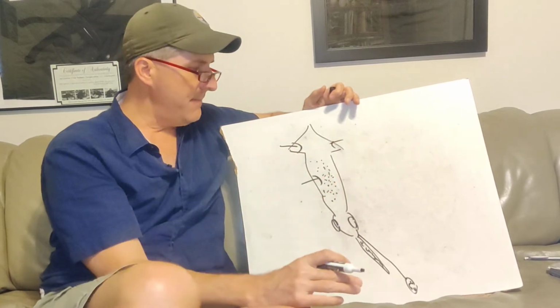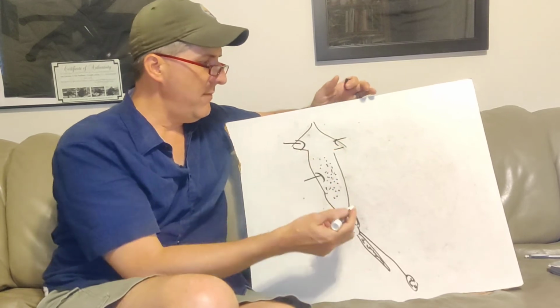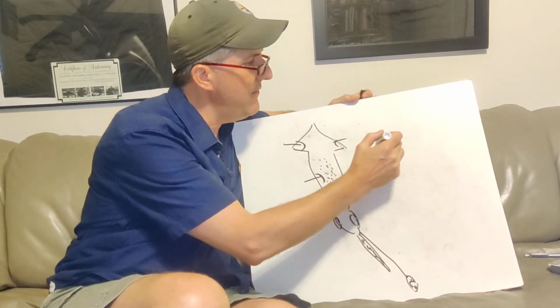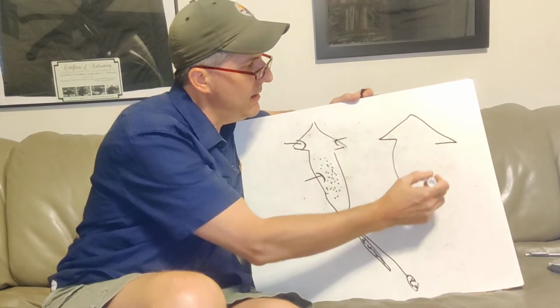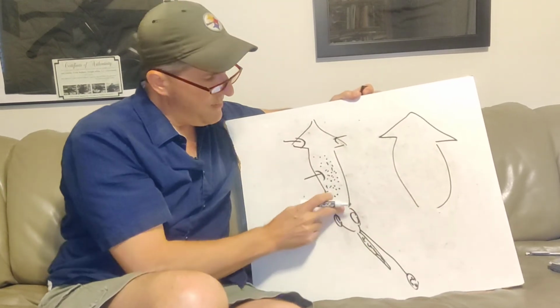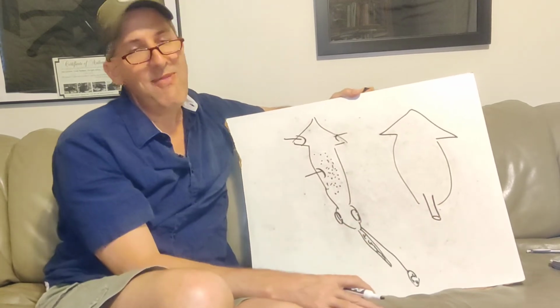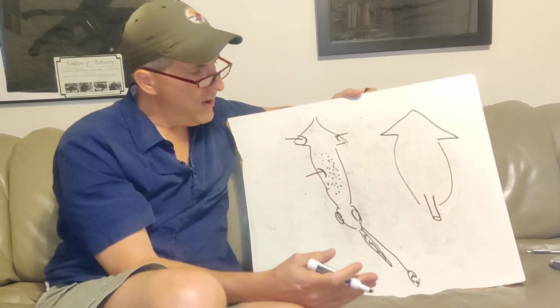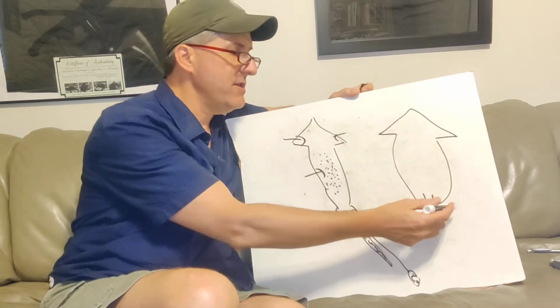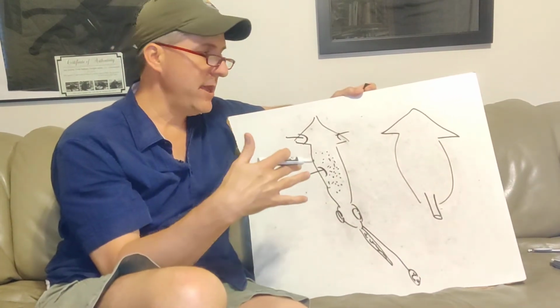Okay? Now, to do the dissection, what you would do is you would take this and flip it over. So I'm just going to have the same rough outline. First thing I tell you is when you flip it over, right where the mantle and the head meet, there's going to be this big muscular tube right there. That's the ex-current siphon. What I then would tell you to do is lift the ex-current siphon and chop the creature's head off, because it's just in the way for right now. We'll come back to it later.